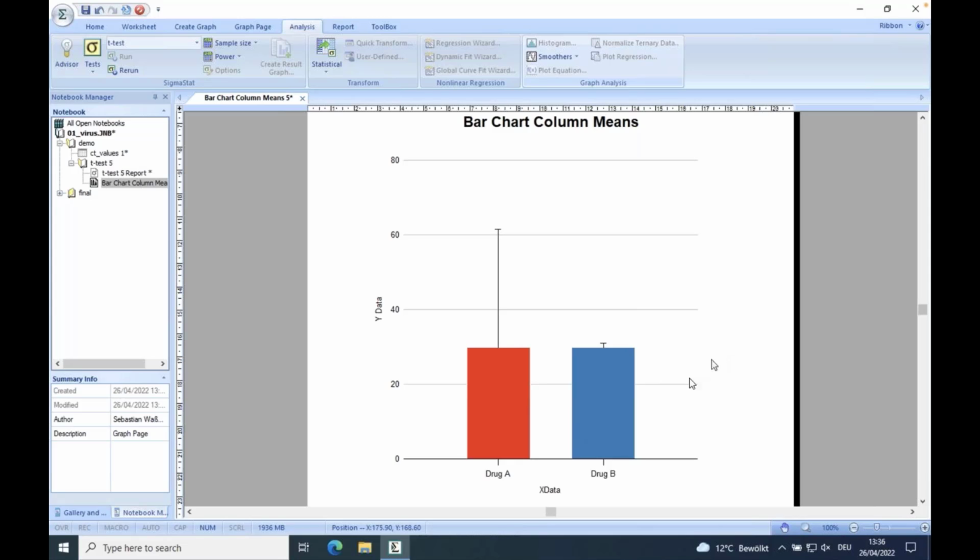Okay, it's not something you would use in a publication, of course, in an academic paper. Usually you won't use that much color for 2 bars, but if you want to have it in a presentation or so, it's great to have another distinction between them. Yeah, you can, of course, add a title to the y-axis.